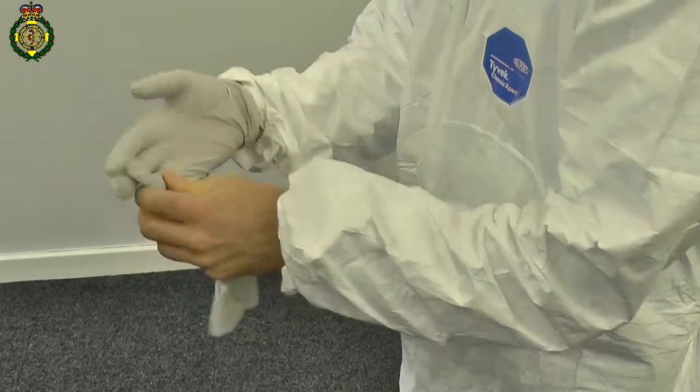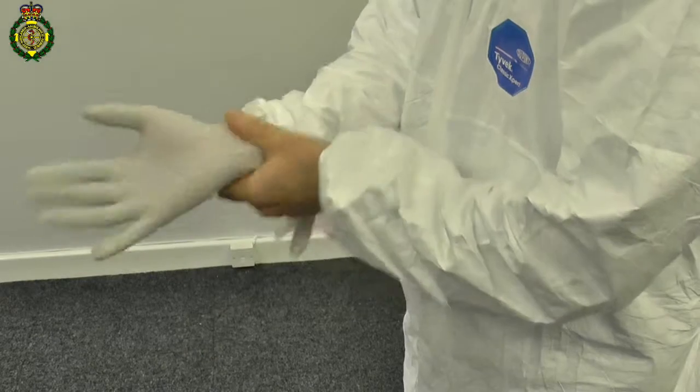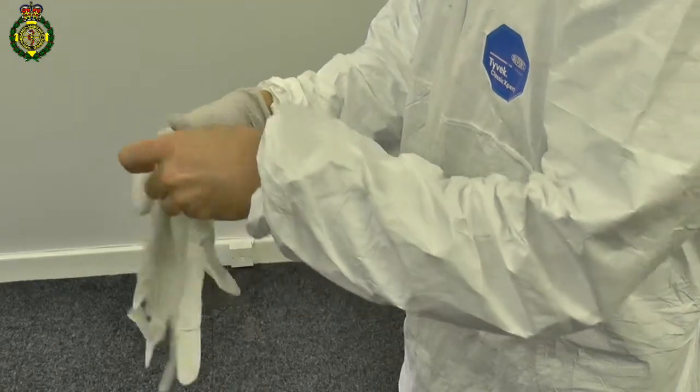Wearing two pairs of gloves is advised. This way the top pair of gloves can be changed on a regular basis to reduce the contamination spread.